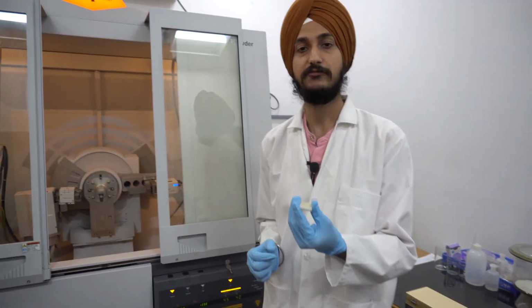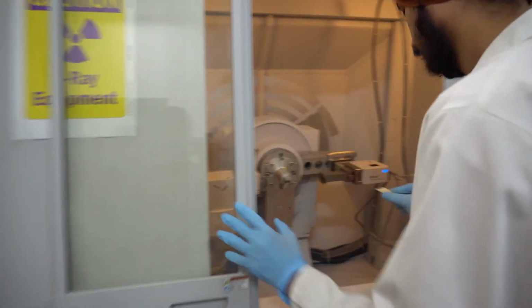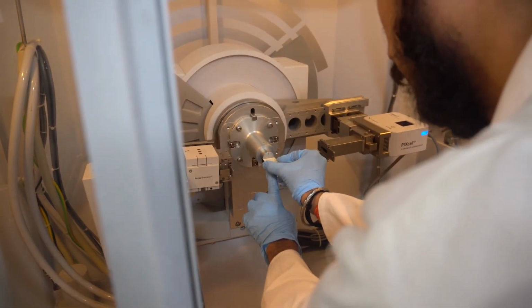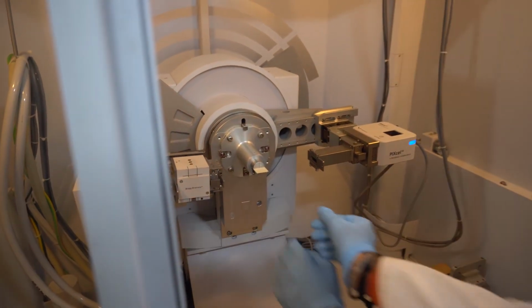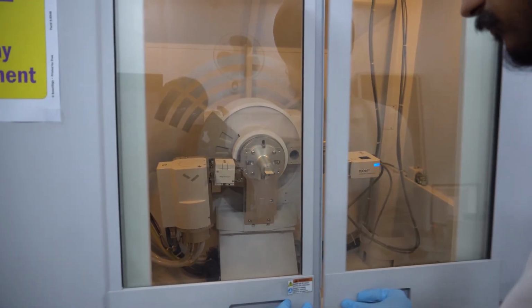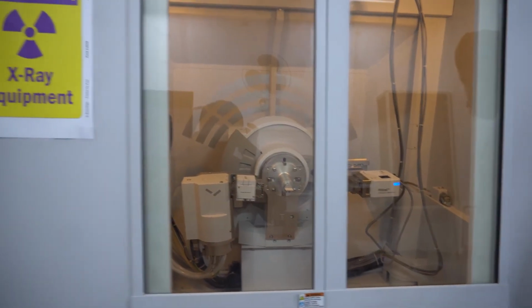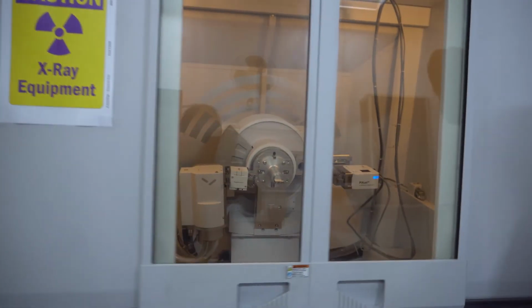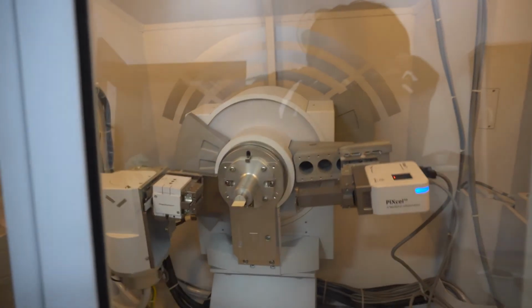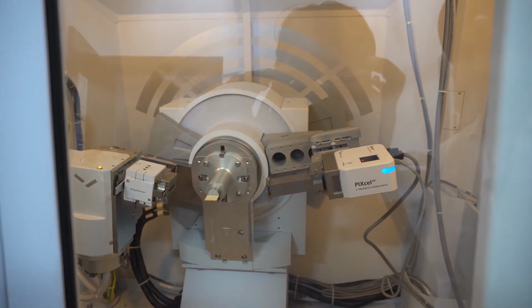So this is the clay slide which I am putting into the diffractometer. This is the sample stage. Slowly we will put the sample onto the sample stage and close the windows. Now as you can see, the diffractometer has started.